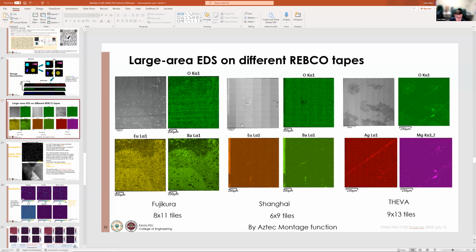That's a good question: if there's drift, or the electron source intensity changes over time, does the stability affect the outcome or the analysis? Do you have any issues with that? Yes, definitely. Ideally you want a flatter surface. These tapes, you don't need to polish them, and I don't have any issues with the niobium or niobium-3-tin samples, but some of these tapes are a little bit hectic.